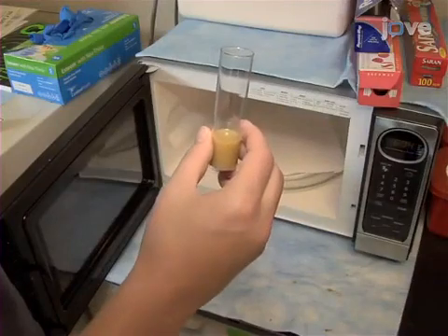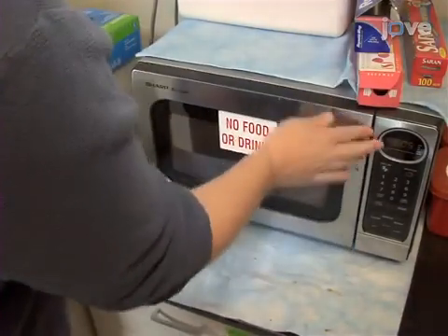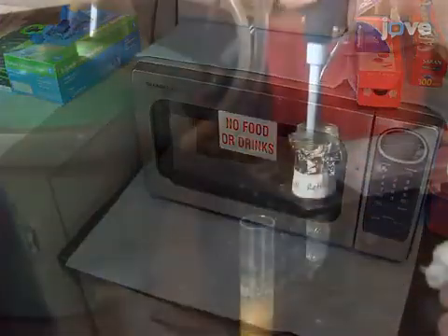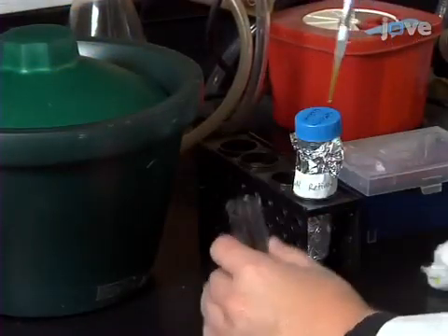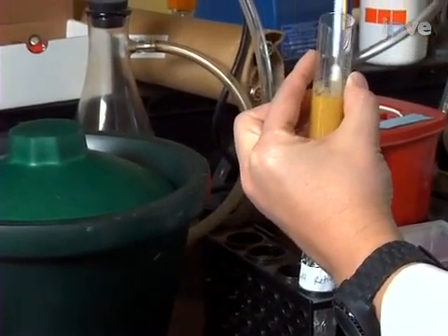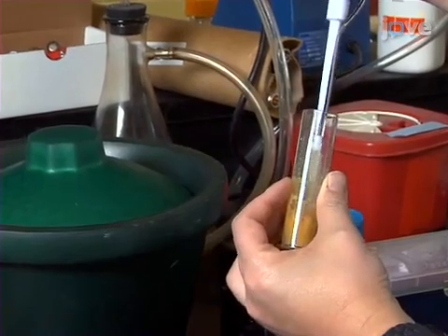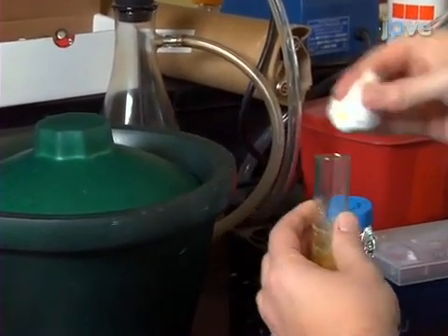Begin by melting standard cornmeal fly food in a microwave and let cool until warm to touch. Once cooled, mix 50 microlitres of previously prepared 20 millimolar all trans-retinal into each vial. Then let vials cool and keep protected from light until required.